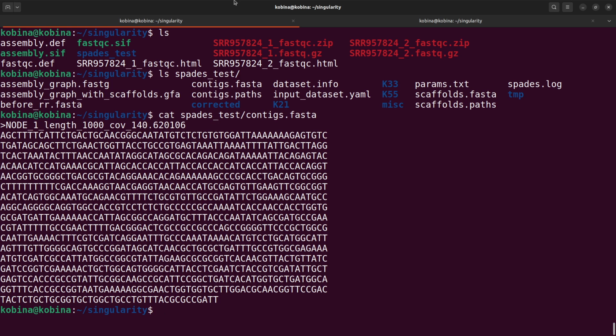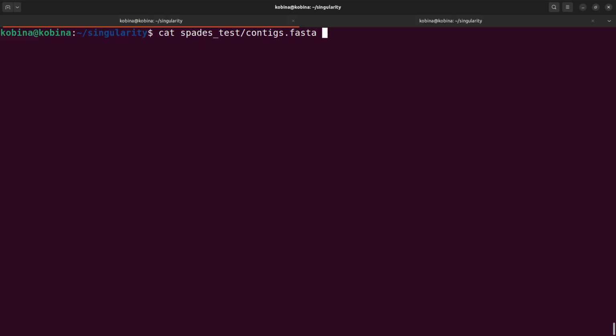Now for the datasets we downloaded, you can also do genome assembly with SPAdes. This can be done after you have done your trimming to remove low quality reads and so on. So the same approach, you just call spades. Let me just show you. You just call spades, and this time you specify your options.